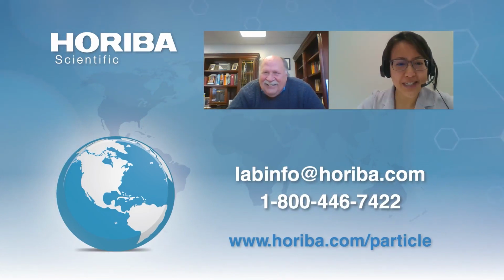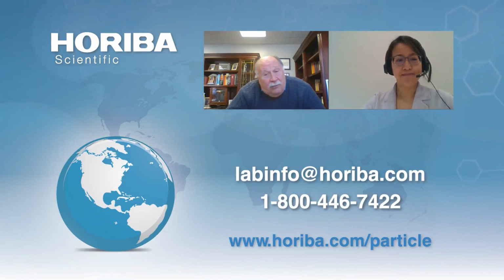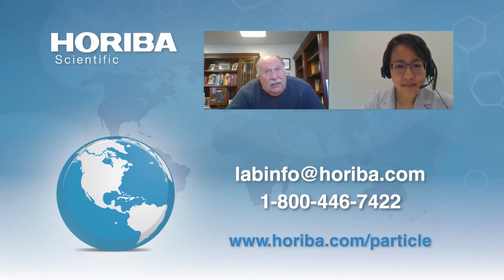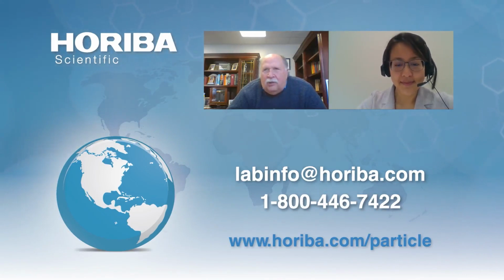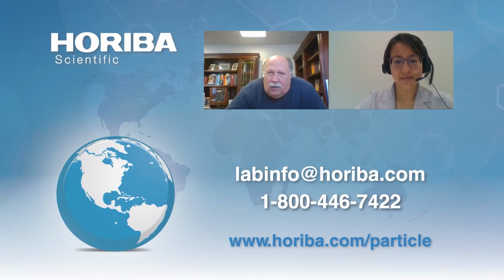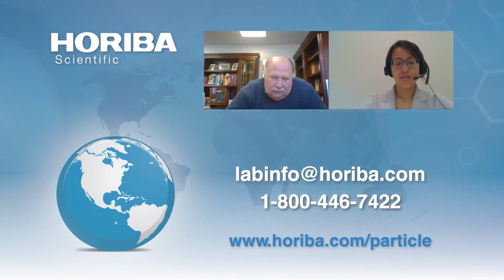The next question is, what about agglomeration in slurries? Well, there are two things that we can talk about. Is the slurry just a wet cake, or is it a flowable slurry? Let's talk about it in two ways. When we did the agglomeration of the yeast, we actually made a paste that had enough viscosity to push through an extruder.